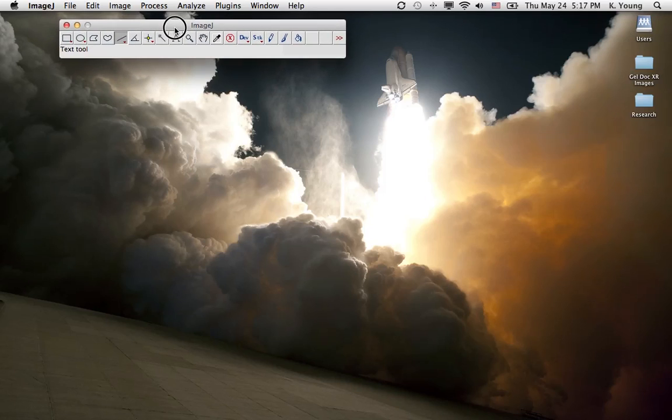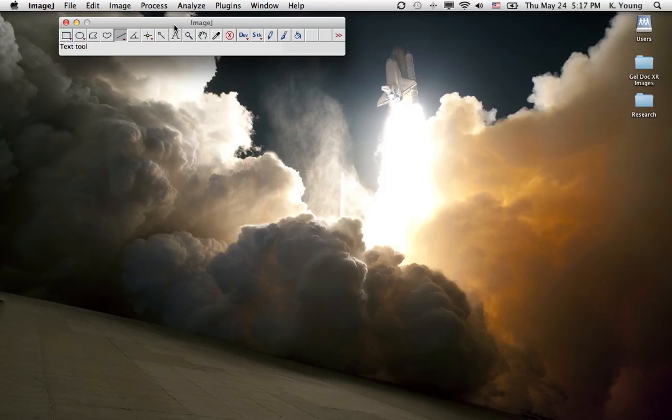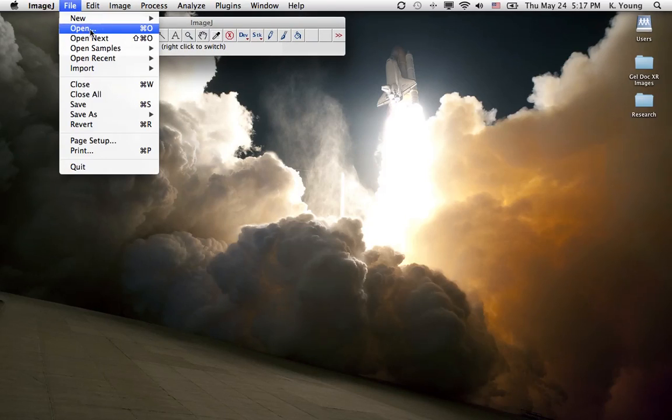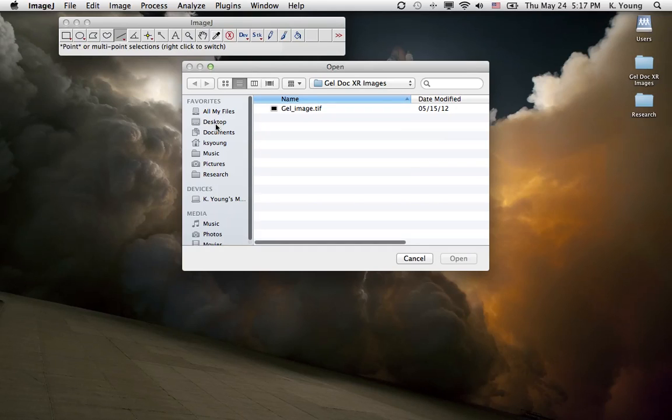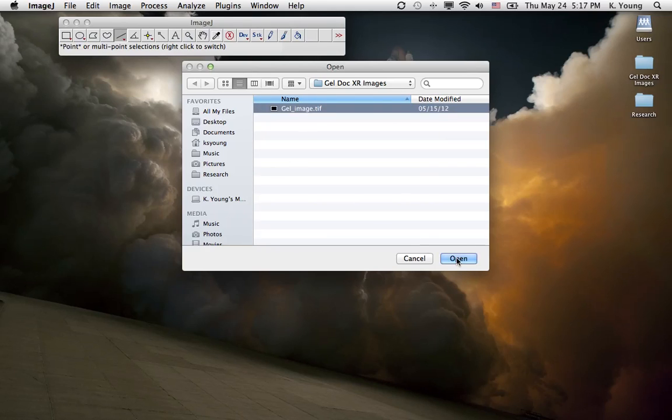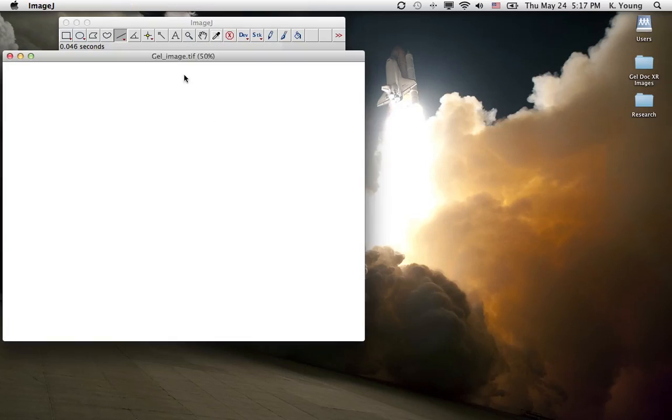What we want to do first is open up the program. I have it here. Click on File. We're going to open up our gel image. I have it saved here. Open it up.